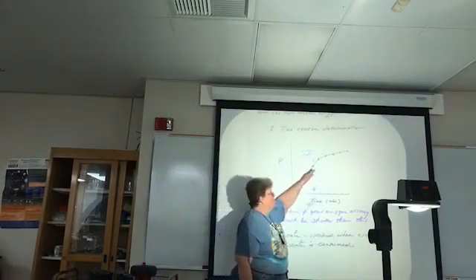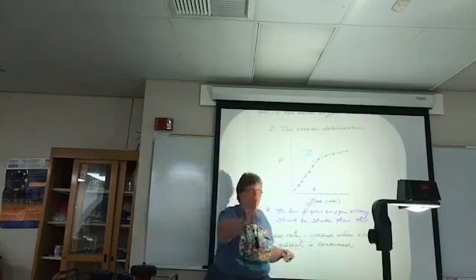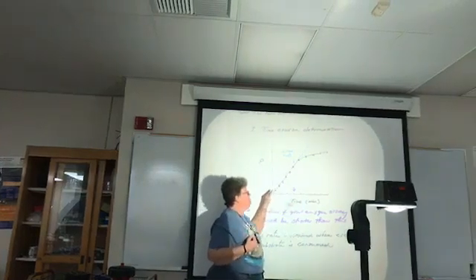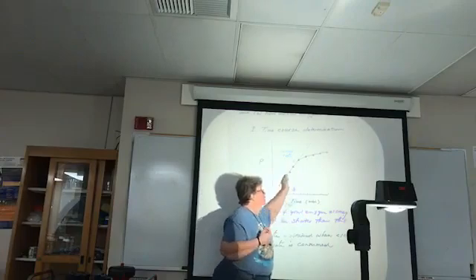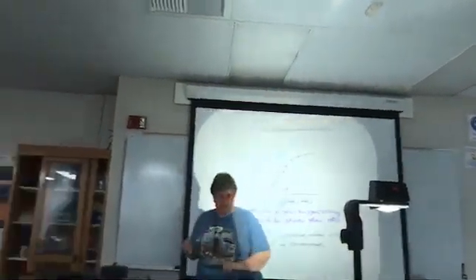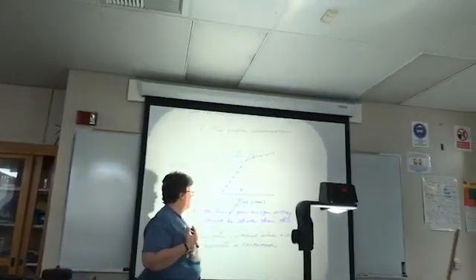So you have an initial graph of product versus time, and I'm going to show you in a minute what you're actually going to be doing. This is a theoretical idea. Product versus time, and you have an initial rate, it starts to slow, and you say, okay, here's my whole graph, but I'm only going to use the ones that are linear. So that's how you know you're getting an accurate rate of reaction.